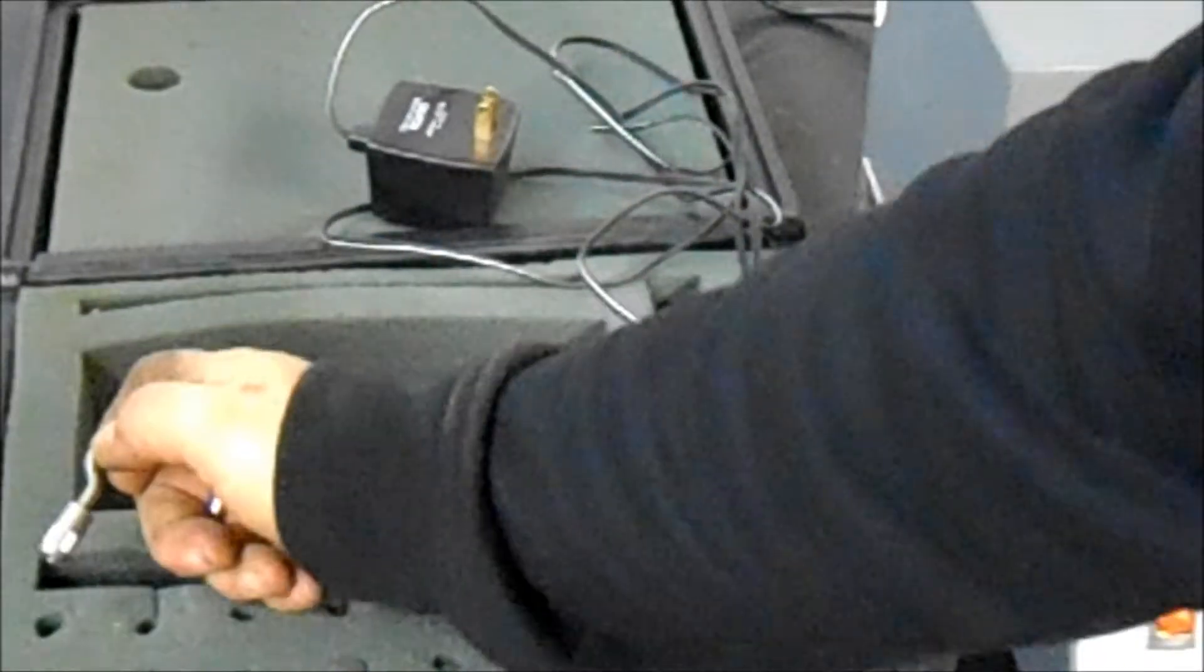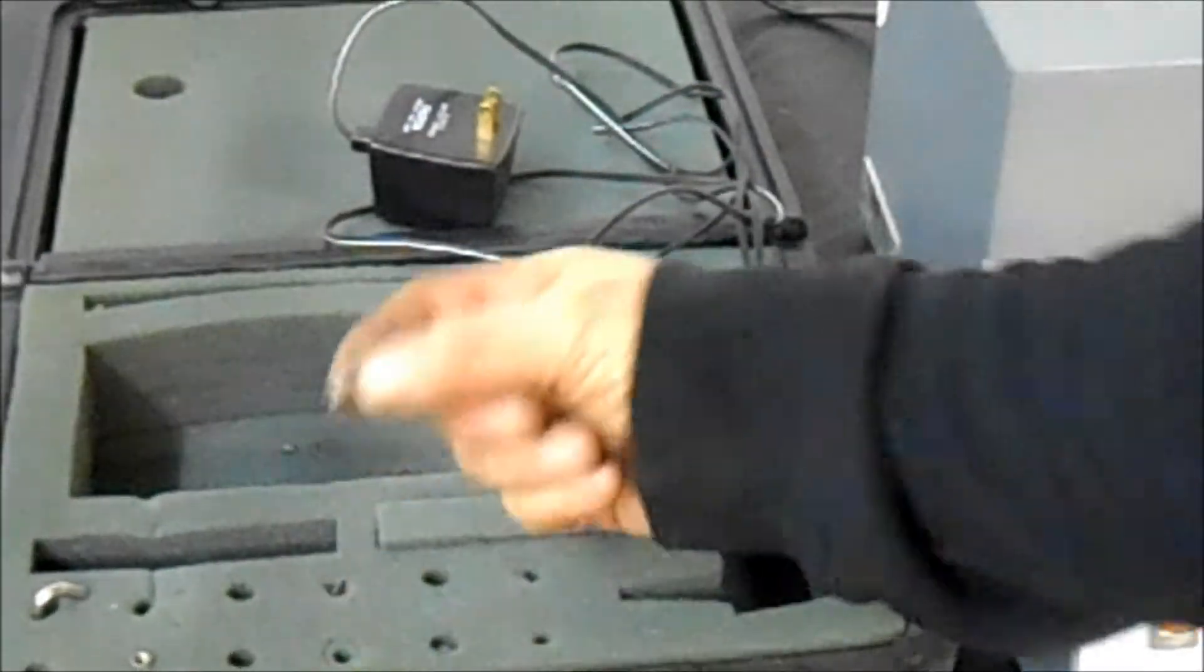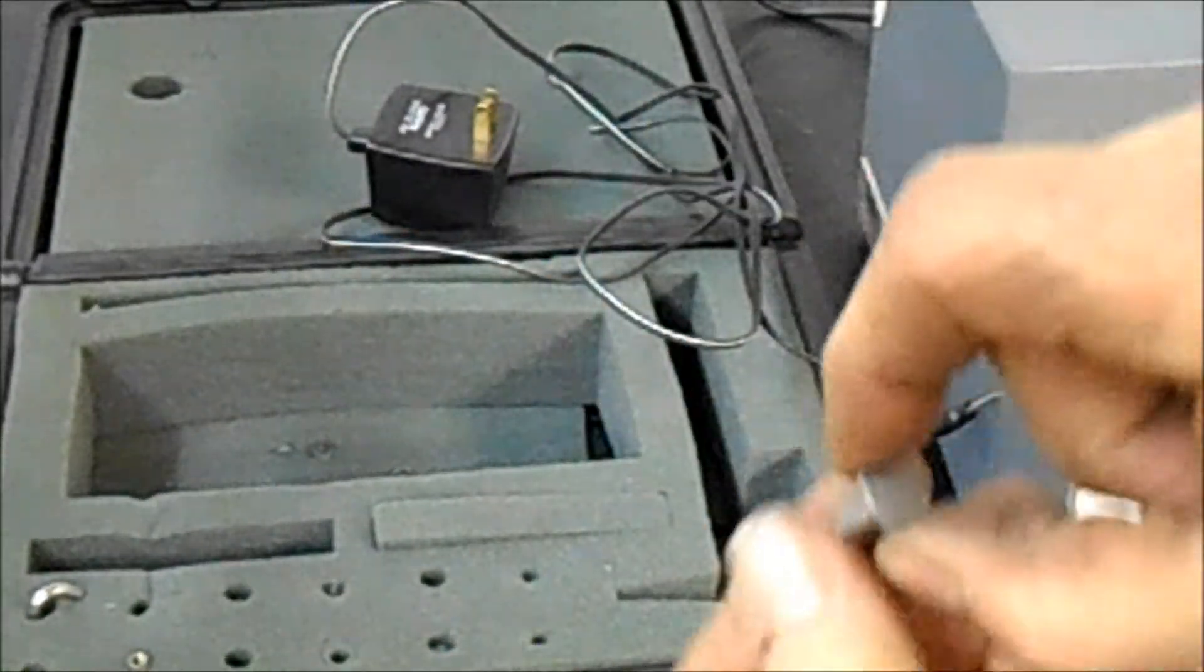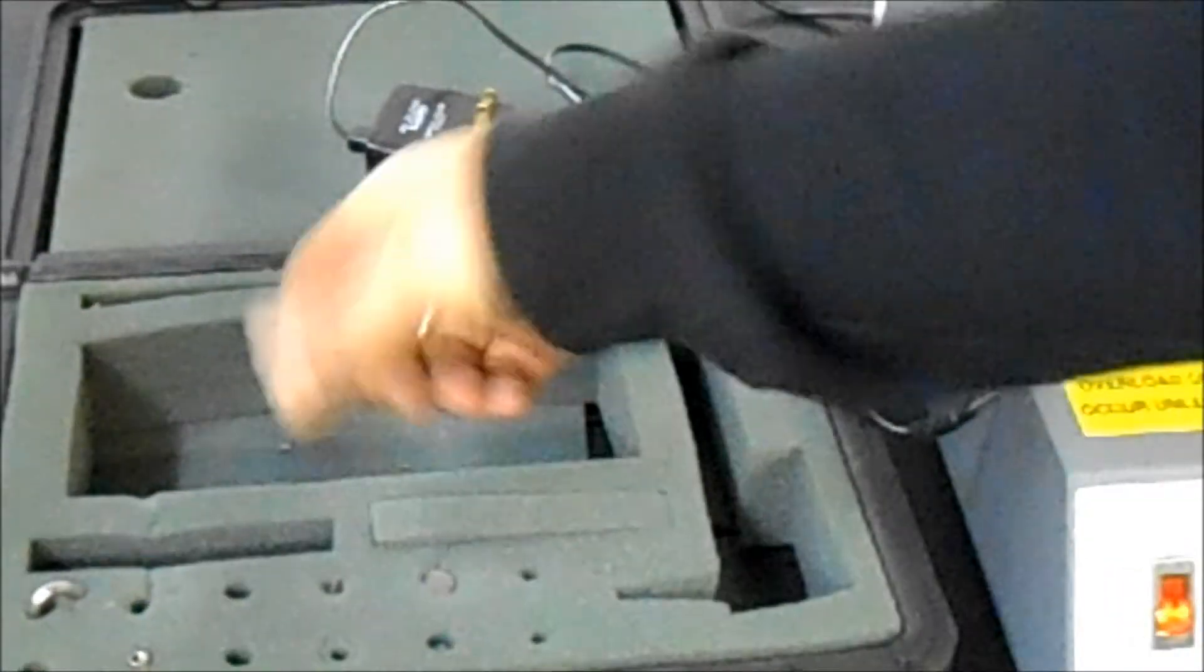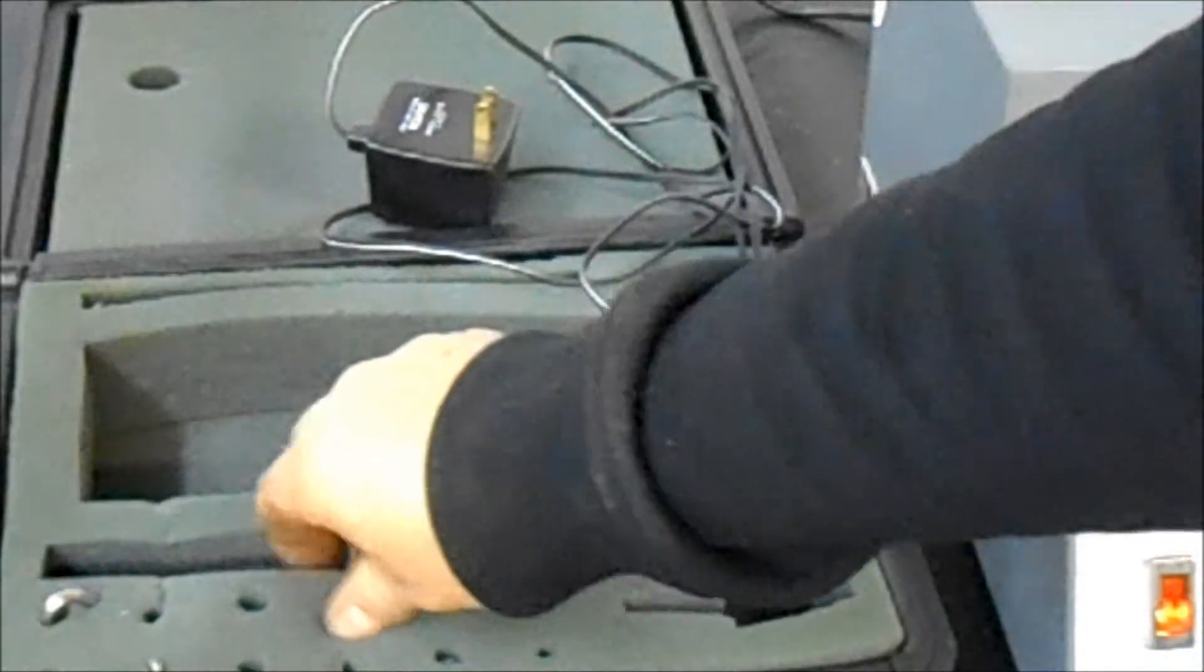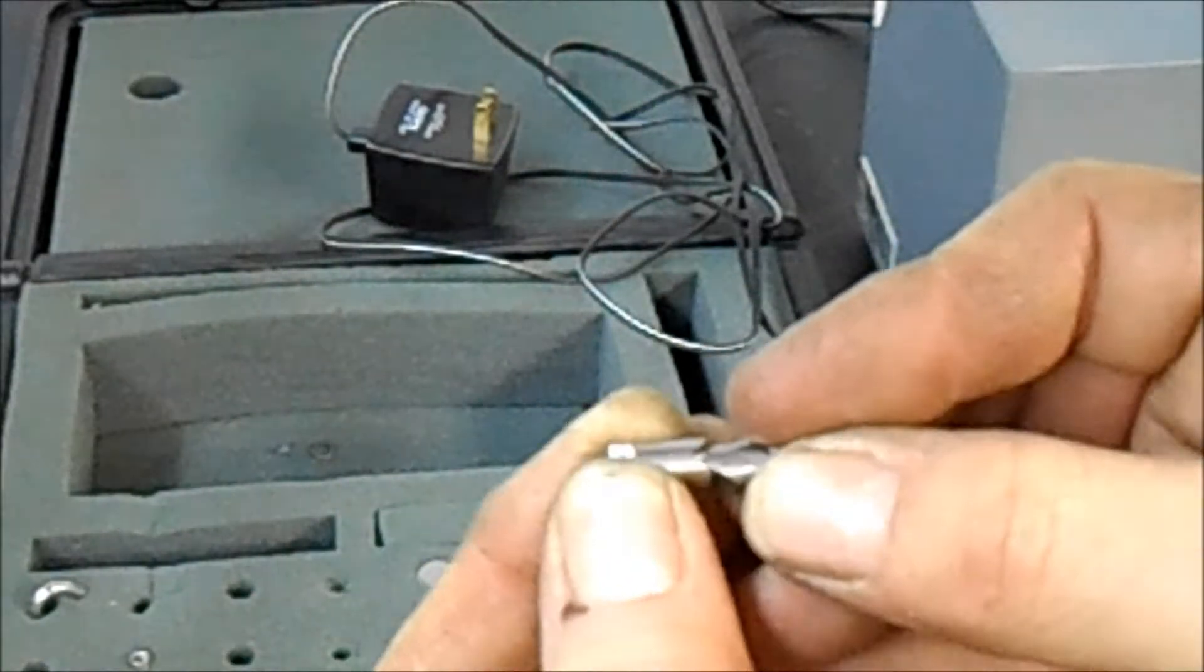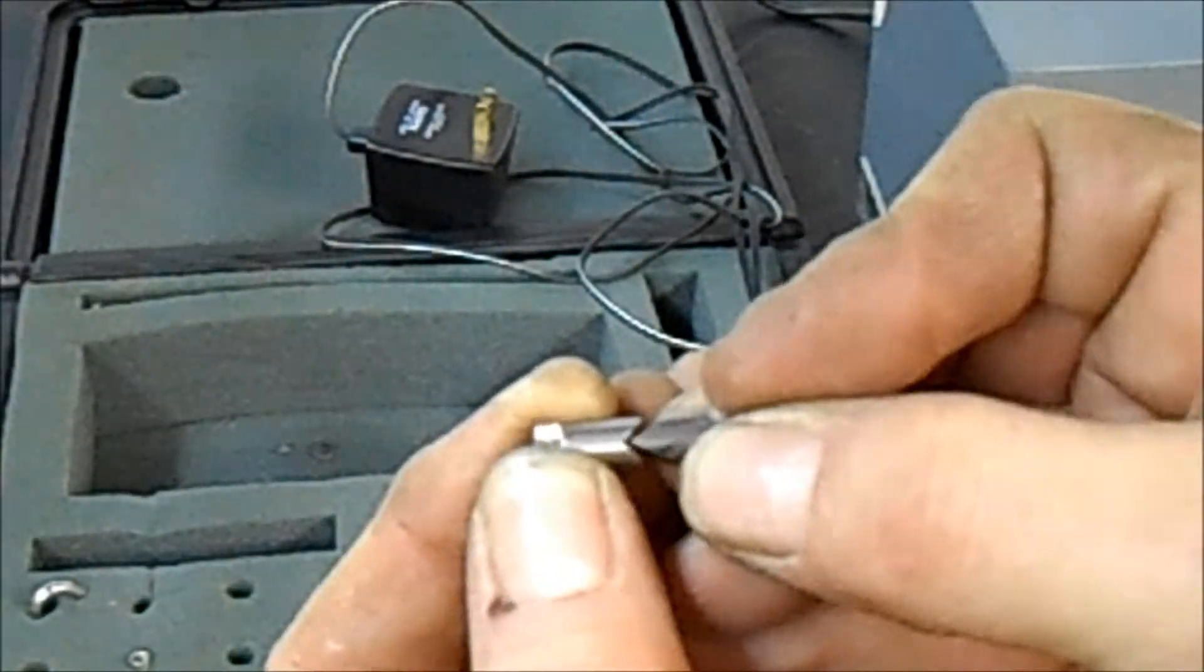It's got a hook. It's got a little mushroom shaped or washer shaped component. It's got two components of the wedge type which are here. And it looks like these two parts, one engages in the other. There's probably some ASTM standard that that refers to.